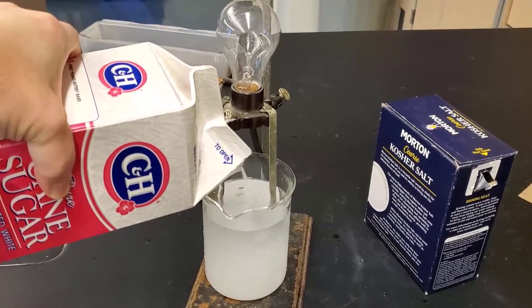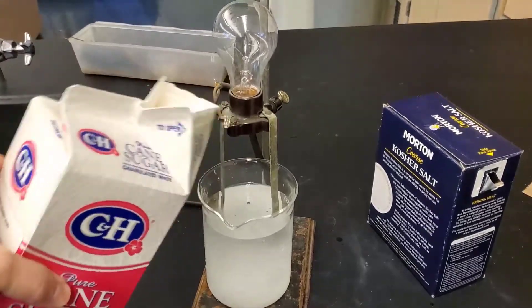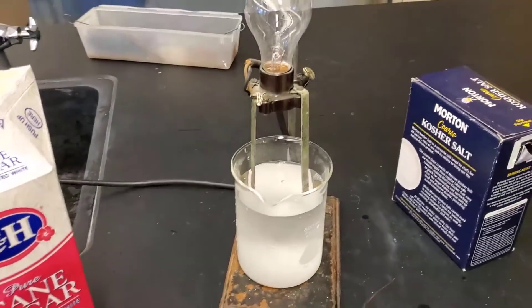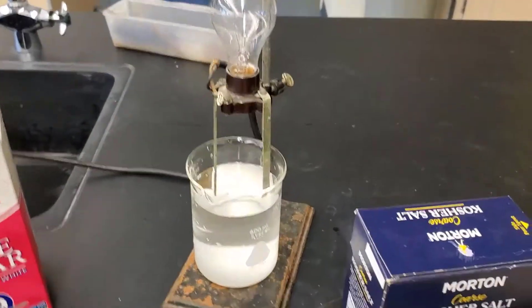Those of you with a sweet tooth are probably just cringing at this. But look, the light bulb is not going on. So for some reason, sugar doesn't break up into ions, and the reason it doesn't is because it's not an ionic compound.